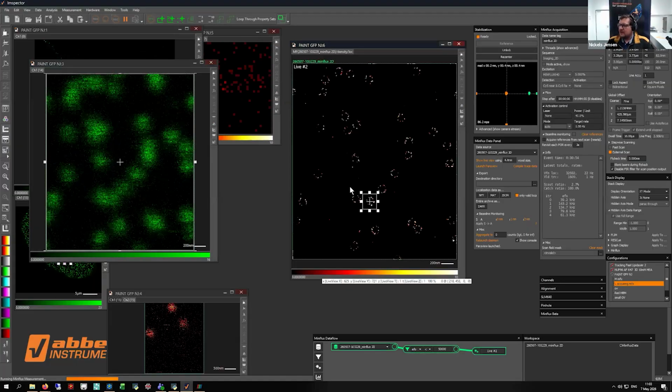So it iterated down from a big L to a small L to a final localization. This localization then is added directly to our image, and by this the image builds up slowly. And as you can see, for instance, here a nuclear pore, you see the single proteins that are really visible in this pore.